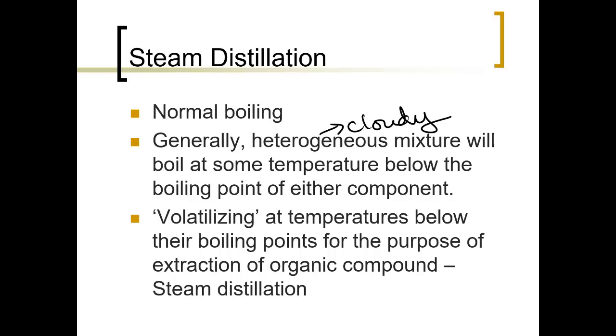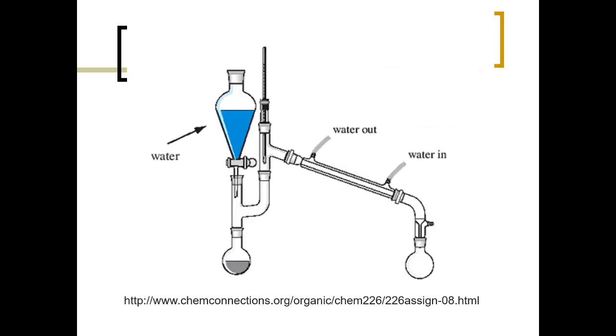And so in your steam distillation, your setup is going to have a separatory funnel so that you can add more water, because we want to keep our level constant. So we always must keep that level, whatever that level is, once you put the cloves in there and you put your 40 mLs of water in there.